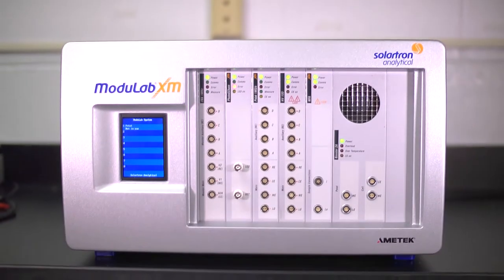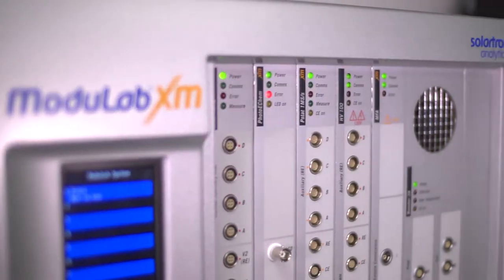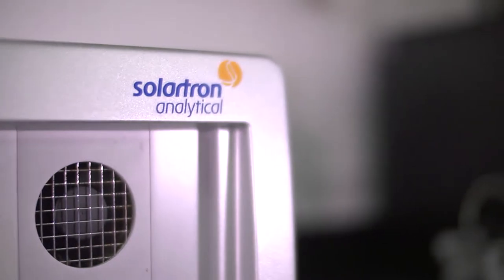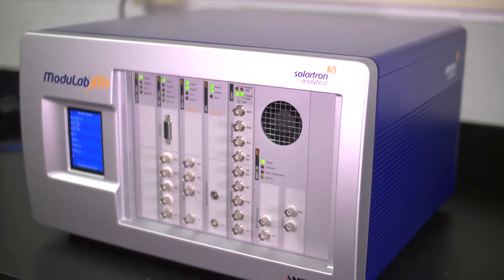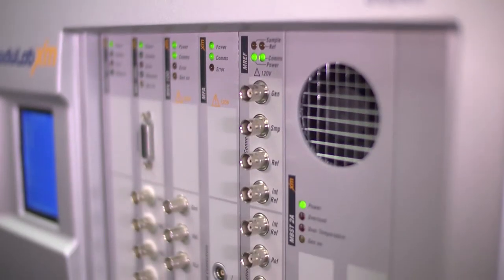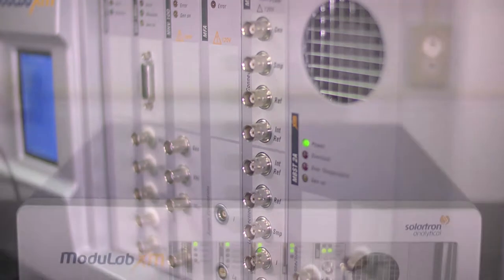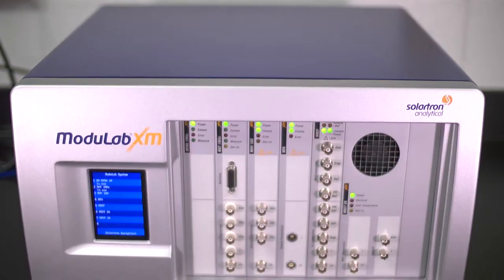Modulab XM-MTS is an extreme measurement materials test system that is able to measure from ultra-high impedance, low-capacitance dielectric and insulator materials to high-conductivity materials in the micro-ohm range. The Modulab XM-MTS does it all.